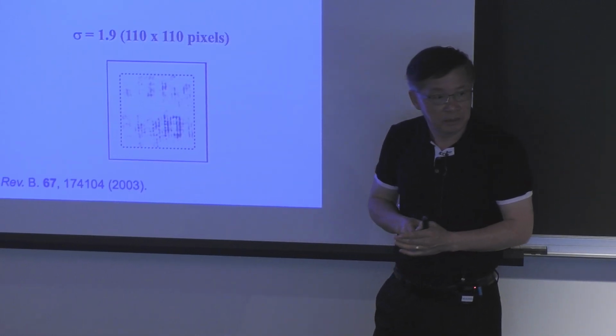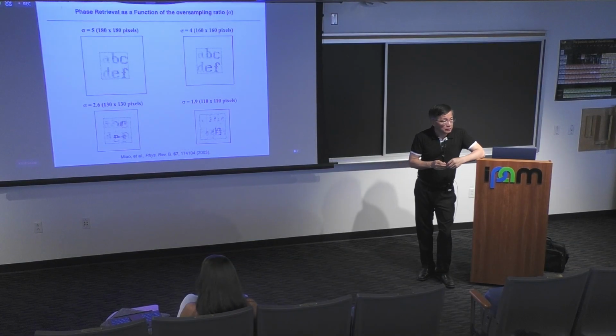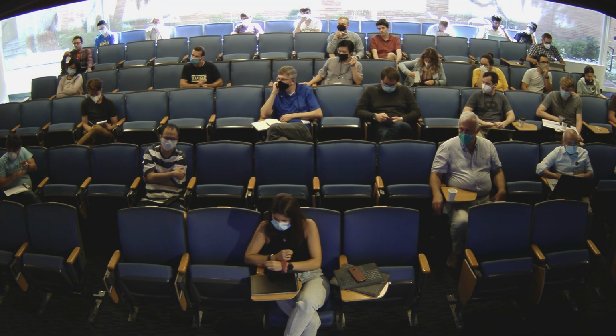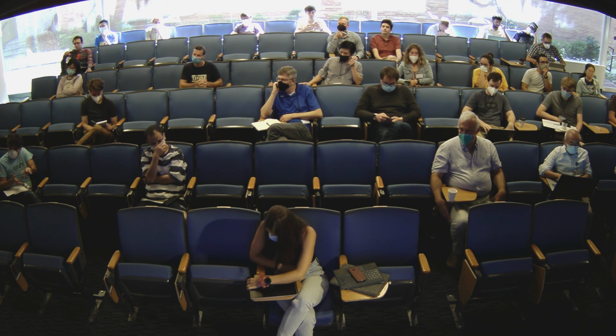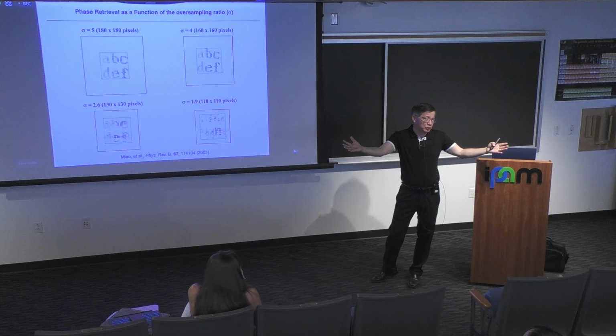So is it correct to say that you formulate the phase retrieval problem like this? You give me the absolute value of the Fourier transform, and you tell me that my signal is identically 0 on a certain region inside the original sample. And that problem turns out to be enough to reconstruct the phase. That's true. There are 2 ways to make it 0. One is that you have a beam that you can define, so outside there's no beam.